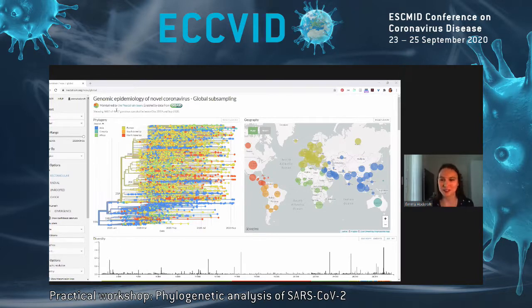Sometimes I know lots of videos can make it hard to load things, but you can go to nextstrain.org/ncov/global in your own browser, and this will load up this page, which is the current live build of SARS-CoV-2 that we're hosting at NextStrain. And as the URL hints, this is our global build. We actually run 7 builds every day. We run 1 global build, and then we have builds that focus on specific regions of the world that we can talk a little bit more about if people are interested in this.